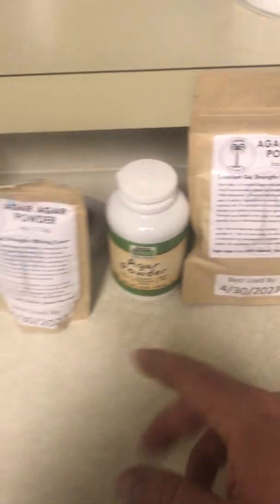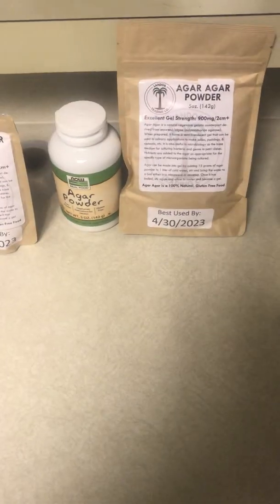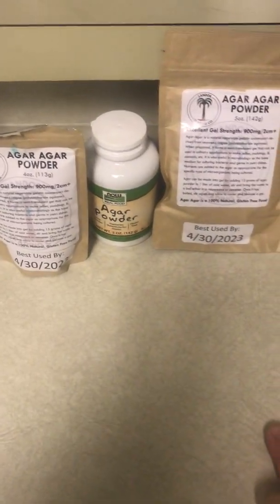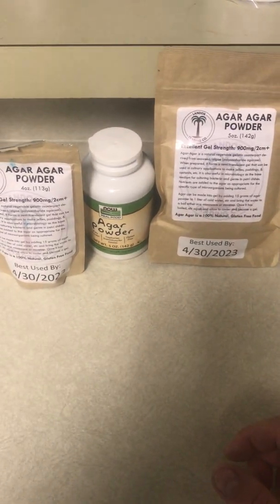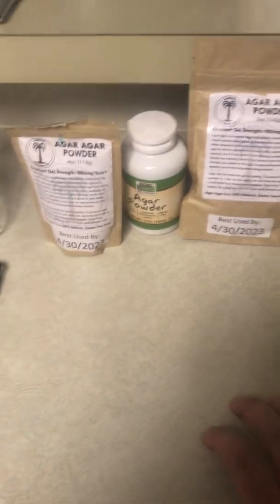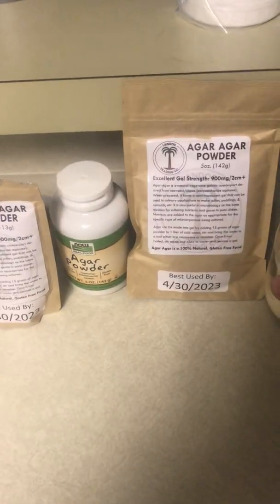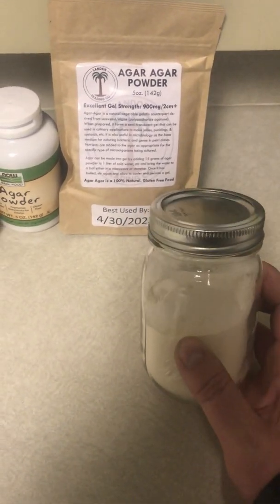Next is agar powder, which runs about $10 to $20 on Amazon. I'm showing three different types here but you don't need all three — they're all options. You can also get pre-mixed agar that comes with nutrients already designed for mushrooms, but I like to mix the nutrients myself.